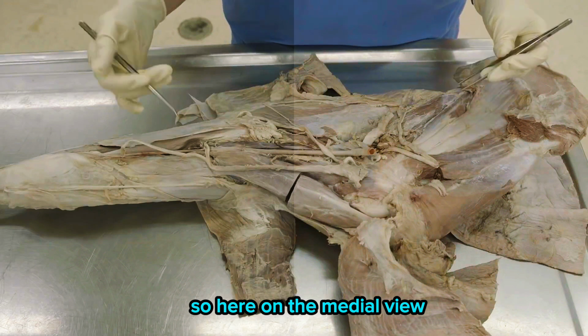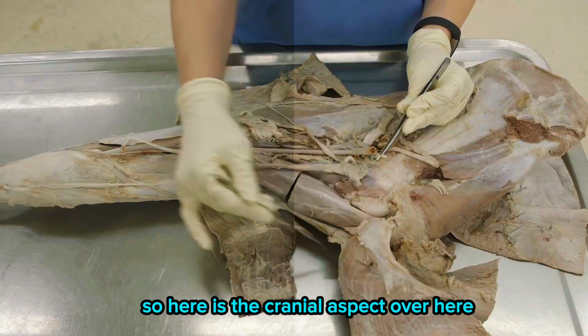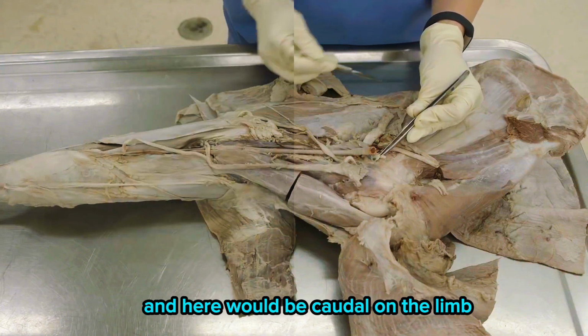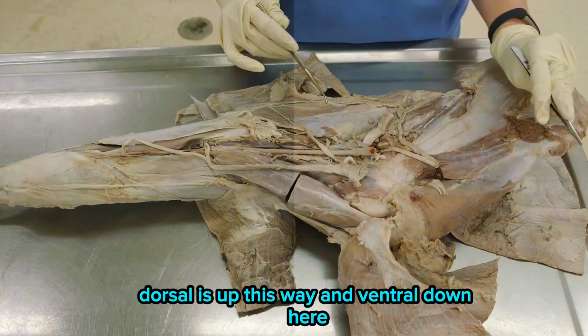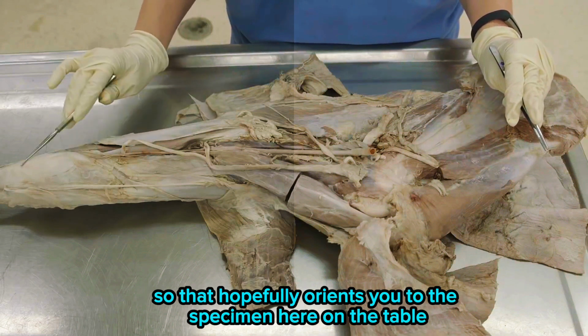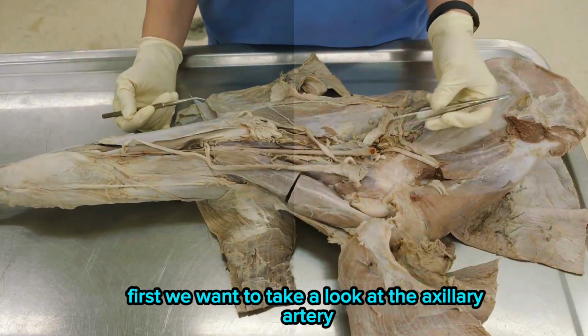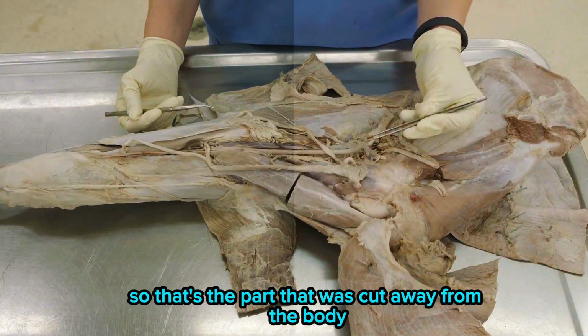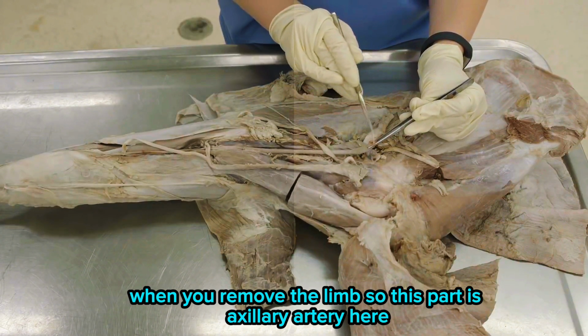So here on the medial view, we want to take a look at these nerves and vessels in this area. Here is the cranial aspect over here, and here would be caudal on the limb. Dorsal is up this way, and ventral down here. So that hopefully orients you to the specimen here on the table. First, we want to take a look at the axillary artery. That's the part that was cut away from the body when you remove the limb. So this part is axillary artery here.